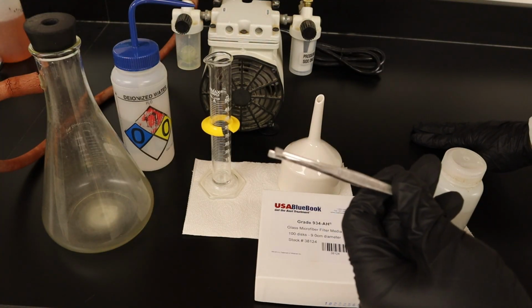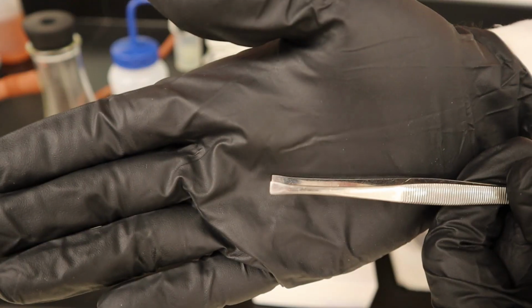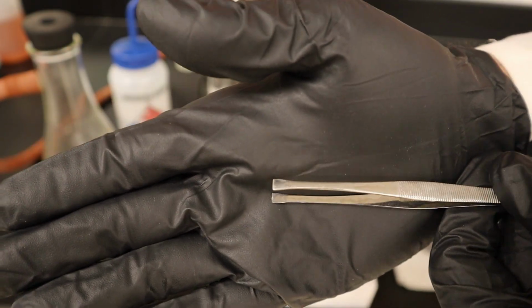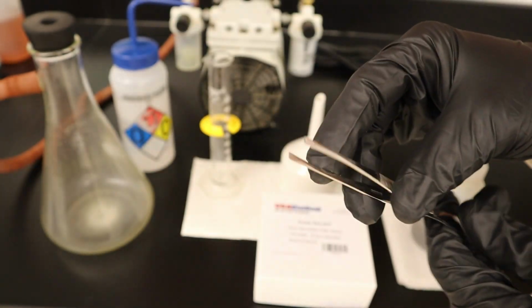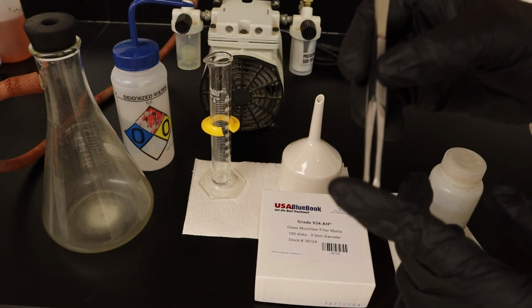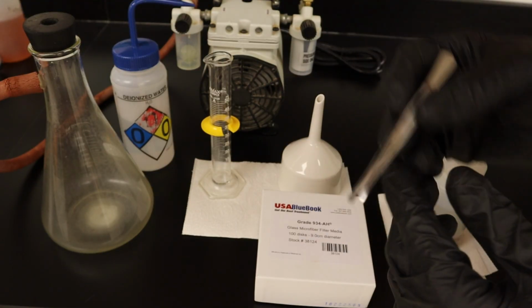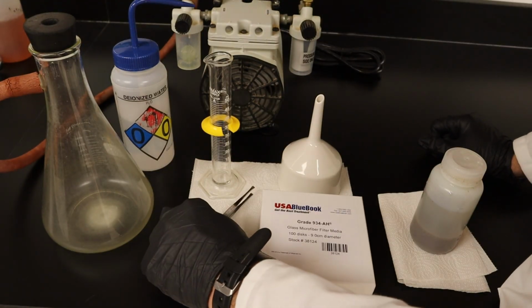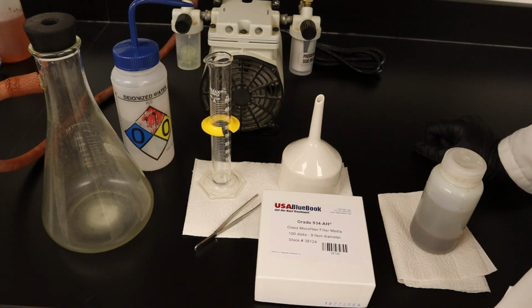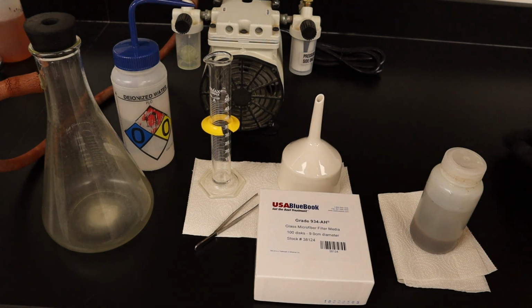The tweezers here, if you can tell, have a flat tip. They are not pointed, they are flat. That's going to come into play whenever we're actually removing the filter out of the funnel. It's going to have some weight to it there, and if they're sharp tweezers, they're liable to rip your filter and cause some issues getting it out. So just having a flat pair of those is going to help you greatly. So let's change direction of that camera and let's get started on the test.